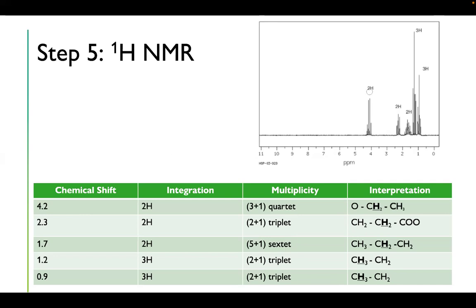There are 4 peaks, which means it is a quartet. This means that it is on a carbon that is adjacent to carbons that contain 3 hydrogens bonded to it. And because it is shifted a little bit more downfield, we can deduce that it's also bonded to the oxygen that is in the ester.